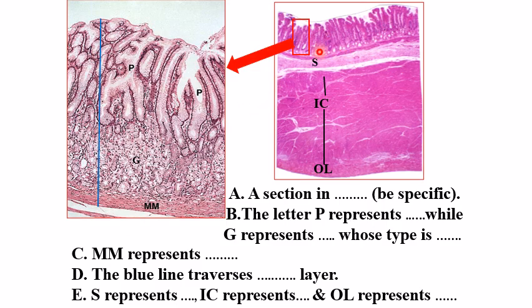Here, dear students, less folded mucosa. The pit is wide and deep. Pit to gland ratio 1:1. Mostly the cells are mucus secreting cells, appears vacuolated. The inner circular is very big. Why is the inner circular very big? As it forms the pyloric sphincter.